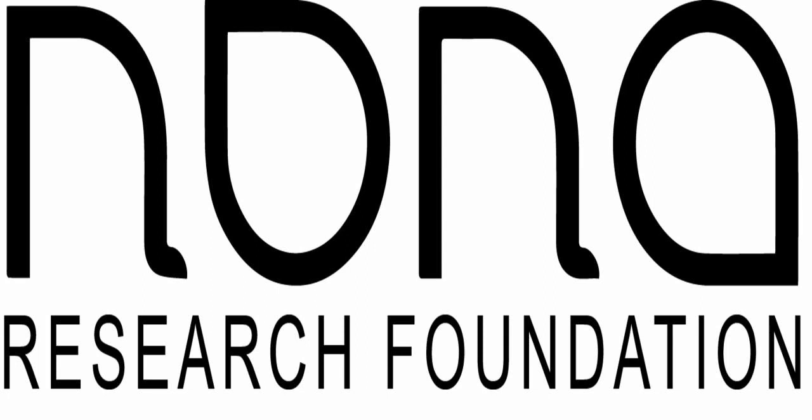They haven't updated it for a couple of years now because during the pandemic they found a new model where they could make profit by selling it off customized for other folks. Maybe there are companies out there that do that with LIMS, but it's not based off this open source fundamental basis, which is a Django application that you can install as a pip package.